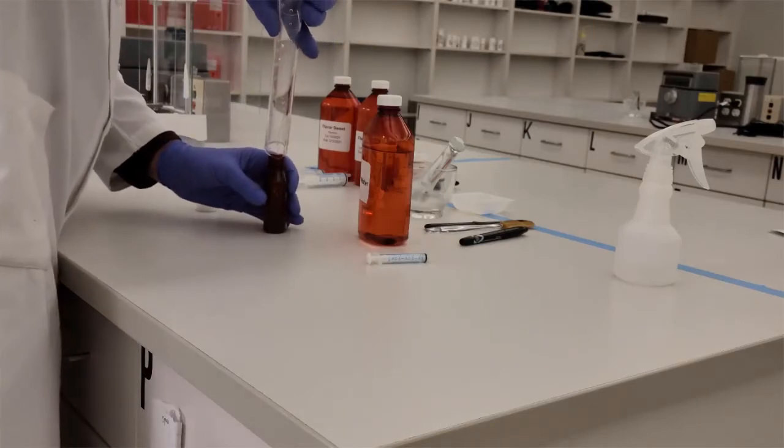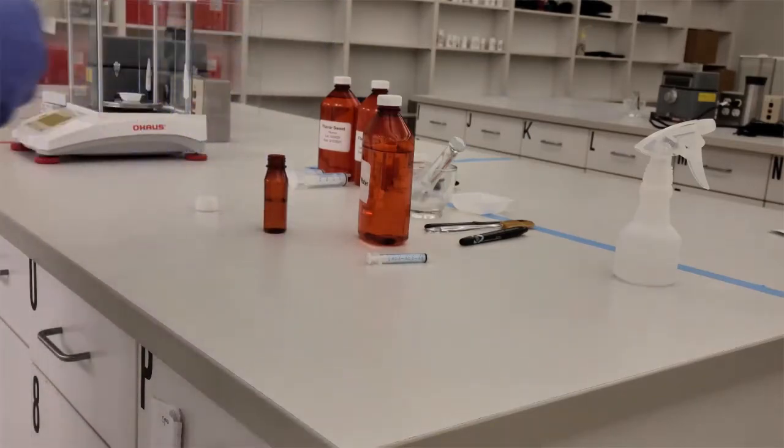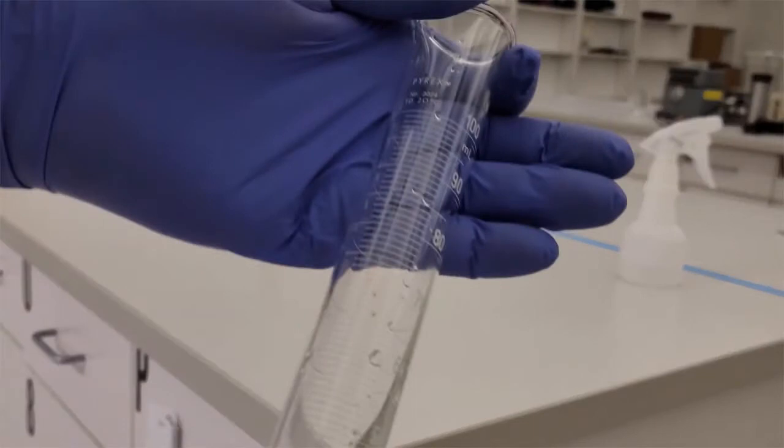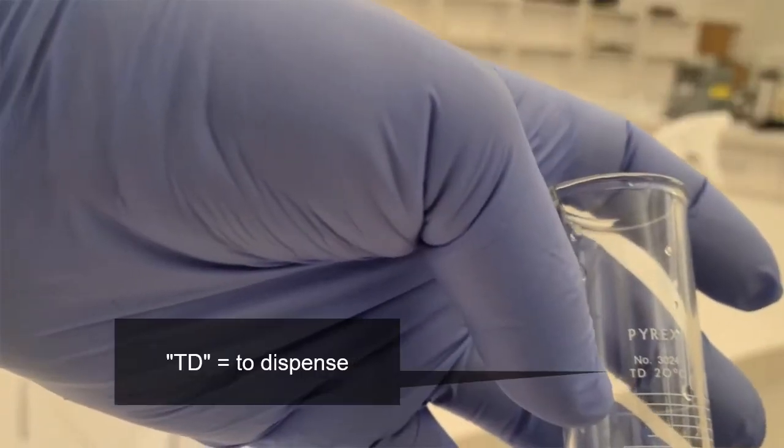Once that's done, I'm going to transfer it into my bottle. And now this is where I know I've measured 35 mLs in the graduated cylinder, but what about the liquid that's remaining inside of the graduated cylinder?